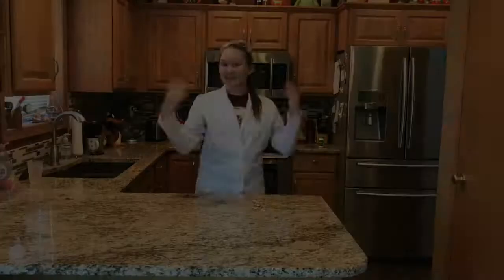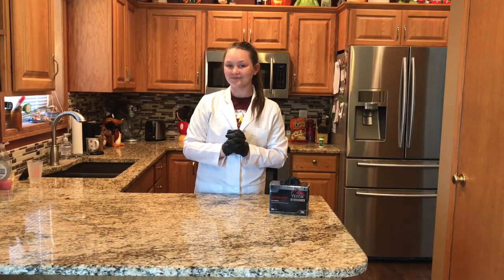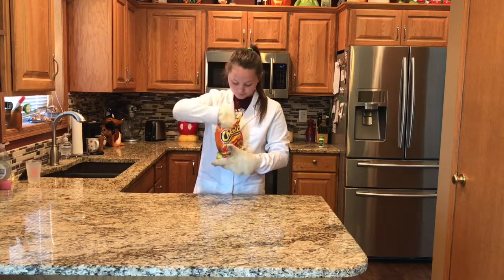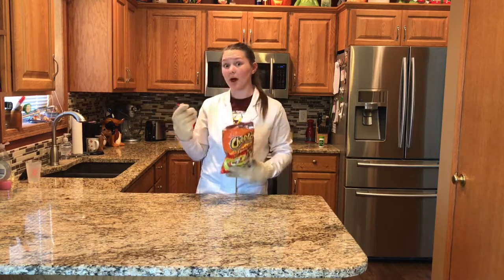Thirdly, safety goggles. Safety goggles prevent the experiment from getting into and contaminating your eyes. Fourthly, make sure to wear safety gloves when dealing with dangerous chemicals. Number 5, make sure to use heat gloves when dealing with anything hot. Those all are hot.